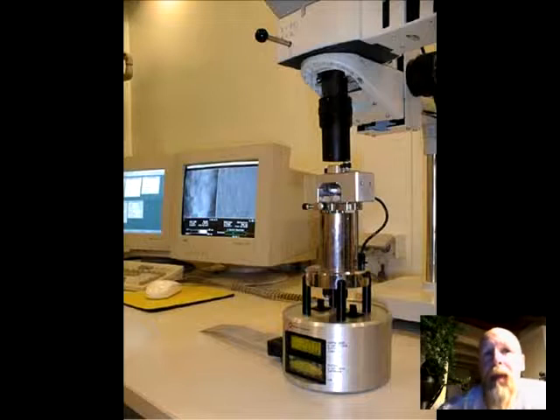Because of the demand to create these micro and nano-sized products and devices, metrology, the science of measurement, has had to keep up. One tool developed to help measure the input, output, and process improvements is the atomic force microscope, or the AFM. This is a modern tabletop AFM.